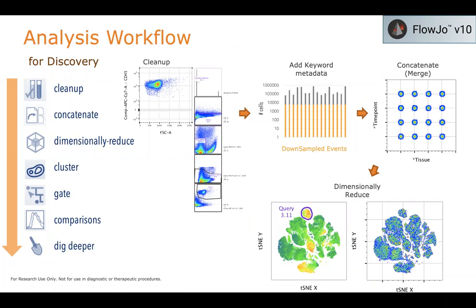You know that these are live cells. They have components or principles about them that make biological sense. If you keep the dead cells in there, the debris, you're going to get some very fantastical results, and it'll send you down a rabbit hole that I'm afraid you probably don't want to go down. Okay, so clean up the data.